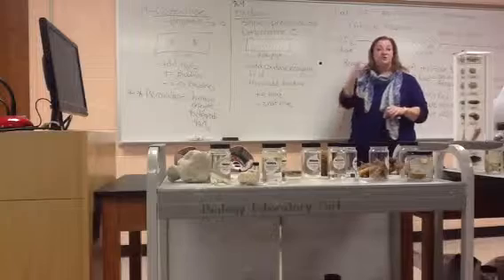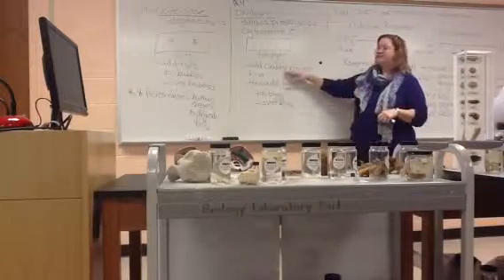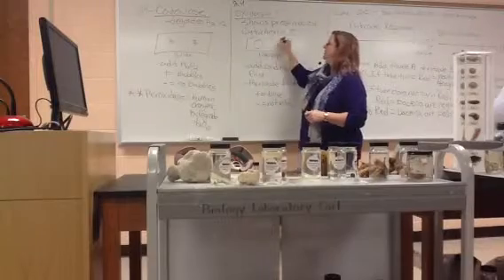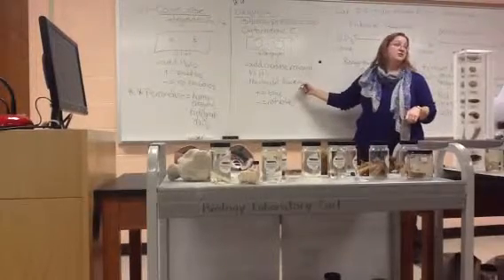And it's in ampules, like your Voges-Proskauer A and B, where you have to break the glass inside. This is in the box up here on the front table. Oxidase reagent, and you're going to make 2 wet spots. Give yourself 2 nice wet areas on the filter paper because you're testing 2 bacteria again. And then you're going to add bacteria.